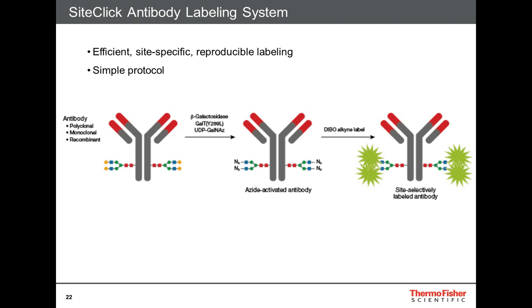And so at a high level, here's an overview of this reaction where we take an IgG antibody raised in a mammalian system so that our carbohydrates are present, proceed through azide activating it, and then use an S-dibo alkyne to attach exactly 4 payloads per antibody.